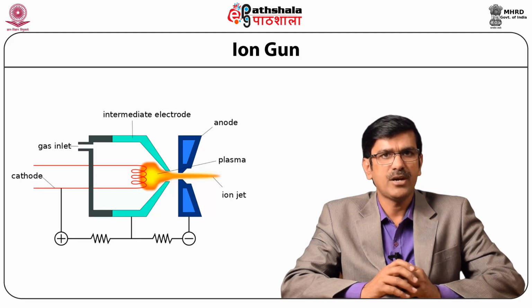Small size 2 mm ion sources are ideal for large area depth profiling in non-monochromatic XPS, and the 5 micrometer ion source is found as a primary source in the ion beam analysis of materials.